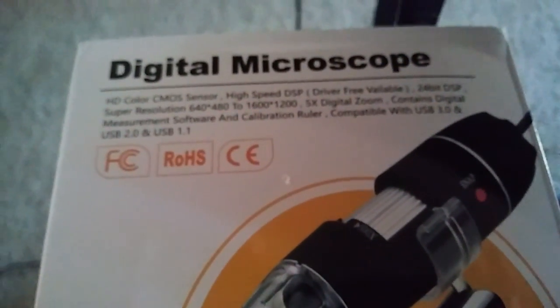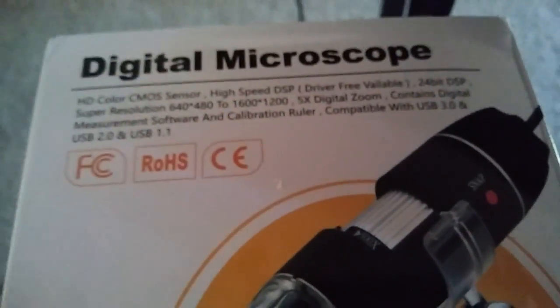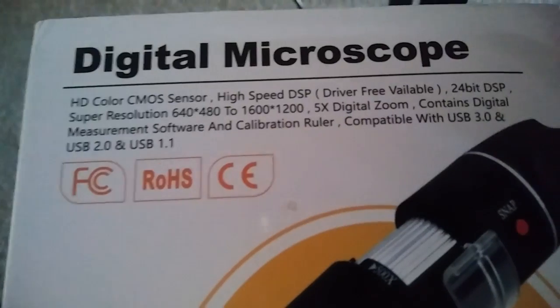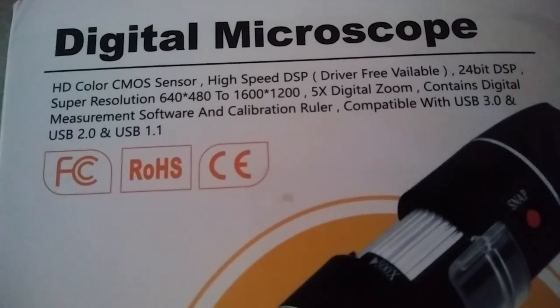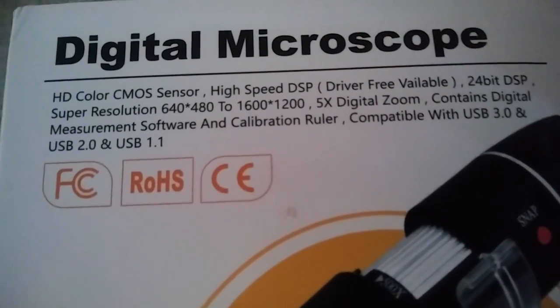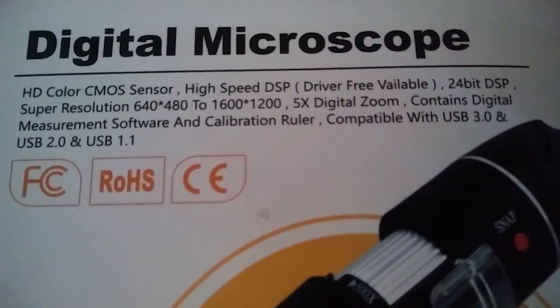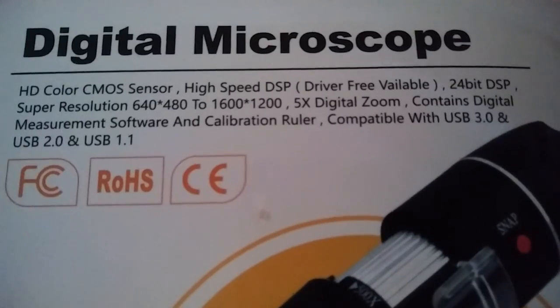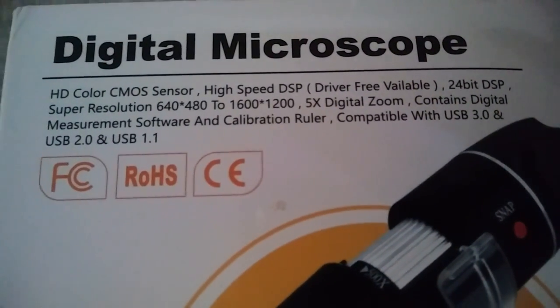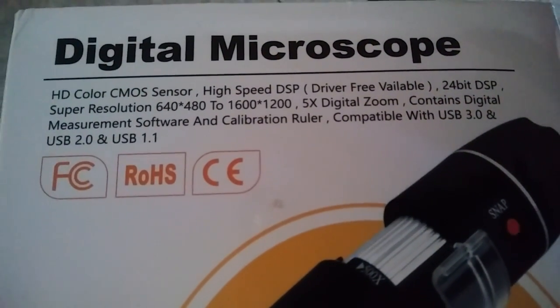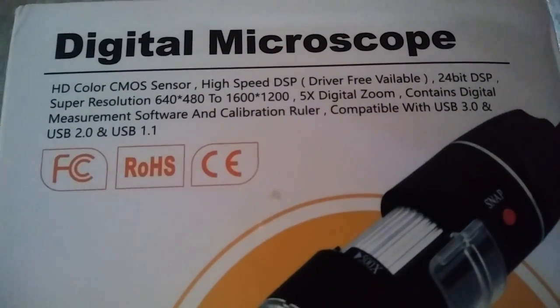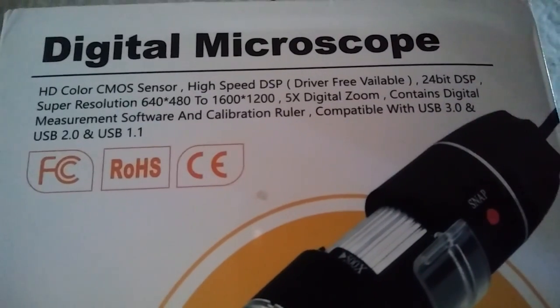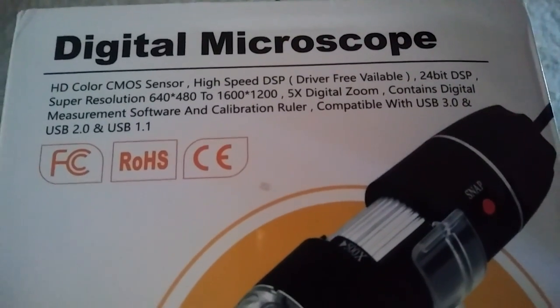Hi guys, I got this really nice digital microscope and it's HD color, high speed, 24-bit, super resolution, 5x digital zoom.